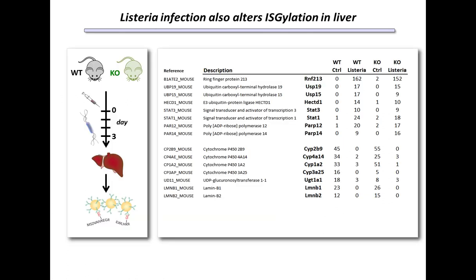Now, as we work in the context of these pathways that control the innate immune system, there is a really important caveat that we should all be aware of when we're thinking about KGG profiling, and it plays out in the context of ubiquitin-like proteins such as NEDD8 and ISG15. Now, it turns out ubiquitin and these two family members all have RGG as the last three residues within their sequence, meaning that when they are cut with trypsin, they generate peptides that can be recognized and enriched and captured by this KGG profiling.